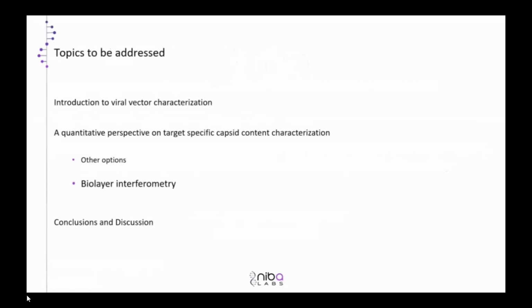The presentation will include an introduction on viral vector characterization so that we see why the characterization of the capsid content is important. Then I will move to the quantitative perspective on the capsid content characterization focused on genome integrity, mentioning options, but the main point of the case study that I will present will be the use of Biolayer interferometry for genome titer and also for genome integrity. In the end, I will have a few conclusion points, and I hope that we will have a nice Q&A session as well.